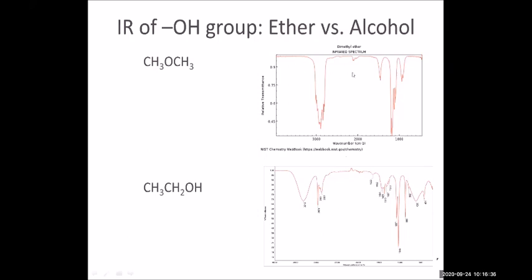The one without OH has a very significant absorption around 3000, which is typical of the carbon-hydrogen bond, and another one from the carbon-oxygen bond around the 1000 area. But the molecule with the OH bond, which is capable of hydrogen bonding, has a very prominent wave number around 3300, fairly strong and wide. The width is because hydrogen bonding is present. There are also some other CH bond absorptions, and you can see some difference in this part of the spectrum, but keep in mind that we typically don't look below 1600.